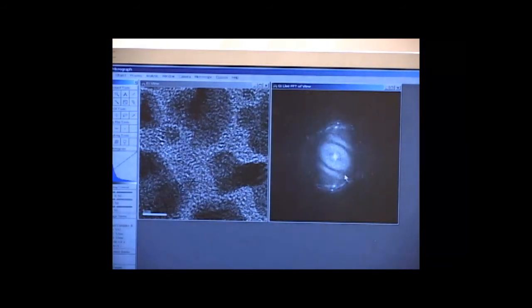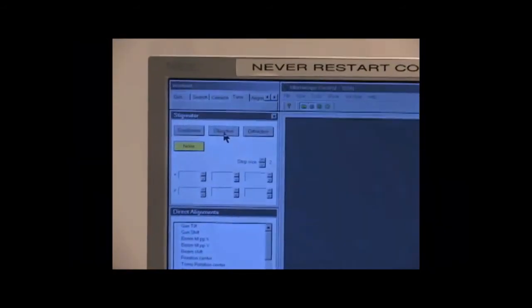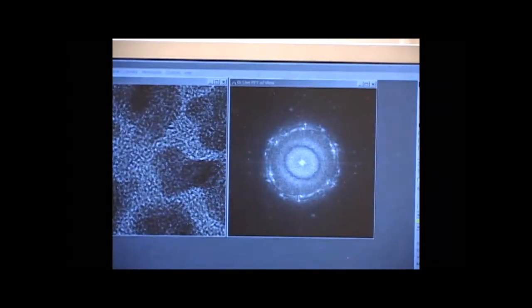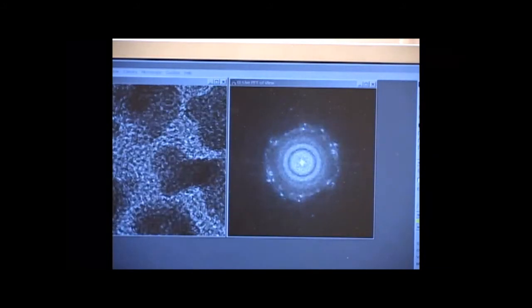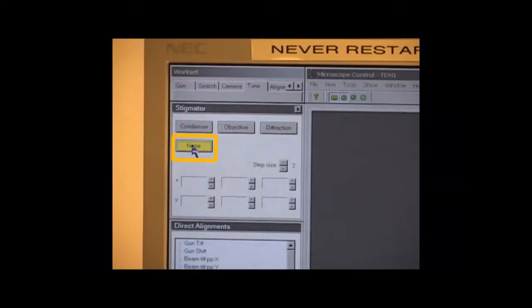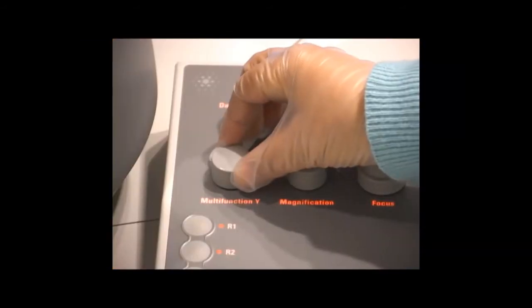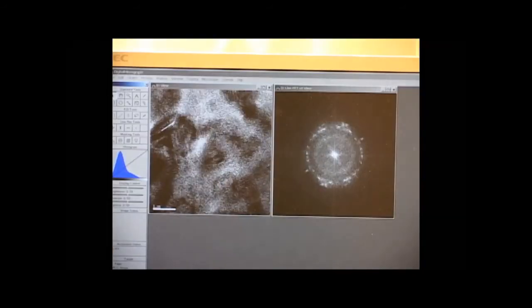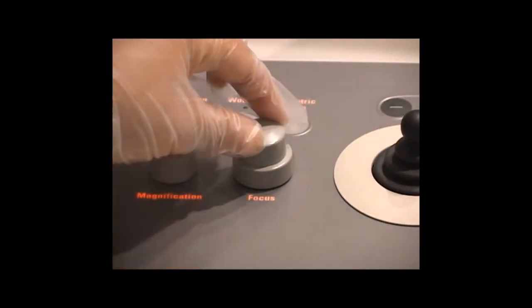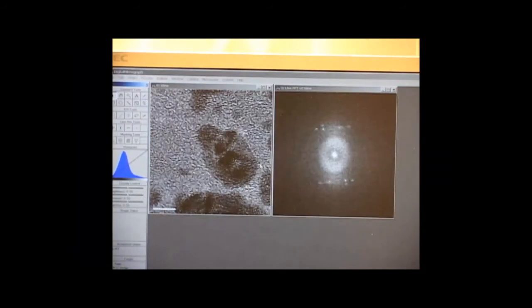Higher magnification is more sensitive to objective stigmation, so it is necessary to correct it again. In the Microscope Control, select Tune, Objective, and then use the multifunction knob to make the FFT image round. The ring of spots is the diffraction pattern from the gold nanoparticles. After the correction, click None to disable the stigmation adjustment. At high magnification, it is best to use the multifunction dial to move the image around rather than moving the sample. Adjust the focus step with the dial collar and use the smaller dial to fine-tune the focus. Use smaller steps at higher magnification. In phase contrast mode, the crystal lattice of the gold particle can be seen.